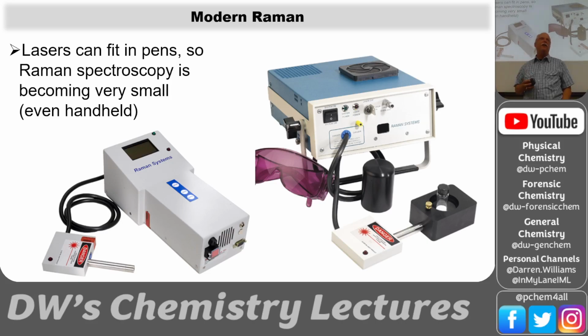Now these things with diode lasers can be toted around with a battery pack. And so Raman has really come into forensics because it can shoot through glass. You don't need to touch the sample. Hey, I like that. If this is a potential fentanyl powder, I'm going to shoot it with a little ray gun. I'm not going to touch it.